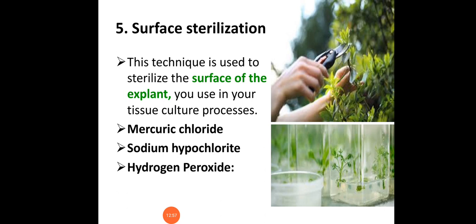By using these chemicals, any unwanted particles bound to the plant material can be removed, followed by rinsing and washing of the material with appropriate solutions.